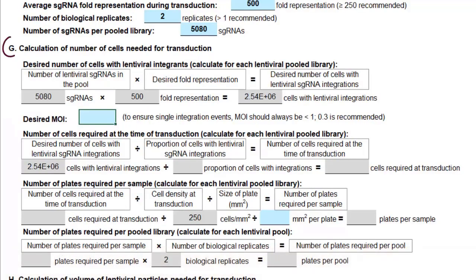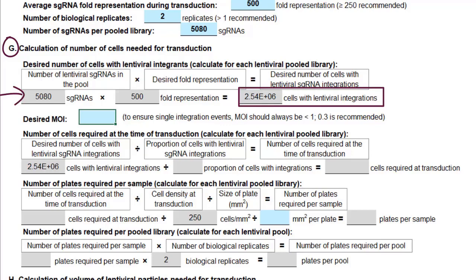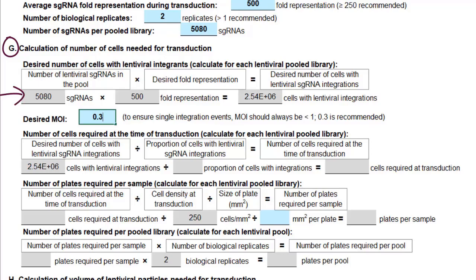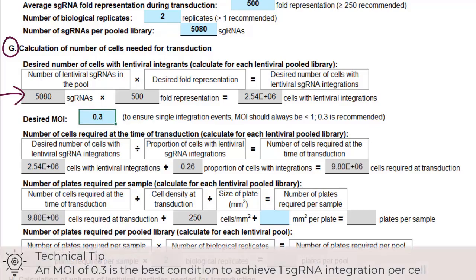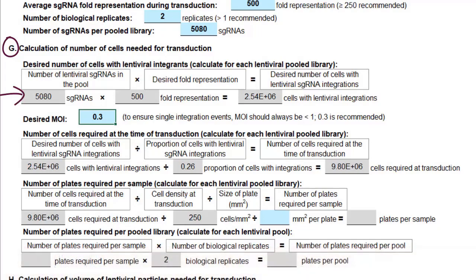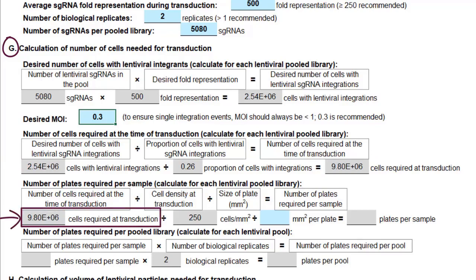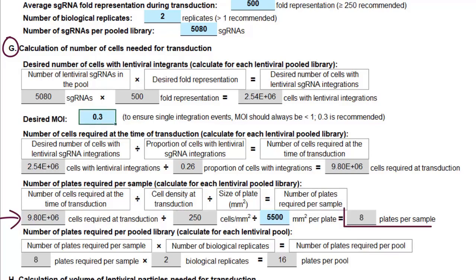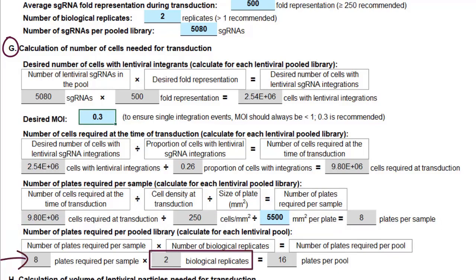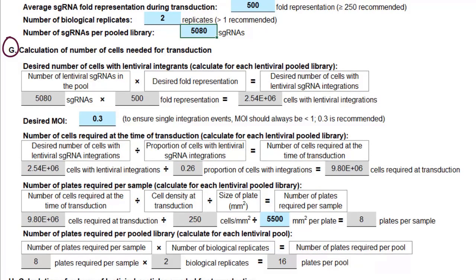Next, we determine the optimal number of cells for transduction. With 5,080 sgRNAs and 500× full representation, the tool calculates how many cells we need with lentiviral integrations. We recommend an MOI of 0.3 so that around 26% of cells get one lentiviral integration and the remaining 74% die in selection. To get enough cells with lentiviral integrations, the tool calculates how many cells we need to transduce. Starting with this many cells, at the density determined previously and using 10 cm dishes, we need 8 plates per sample. We want 2 biological replicates, so that's 16 plates per pool. If we use a different library, these numbers will change.